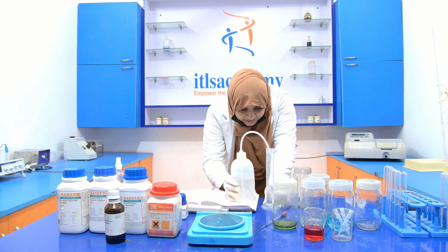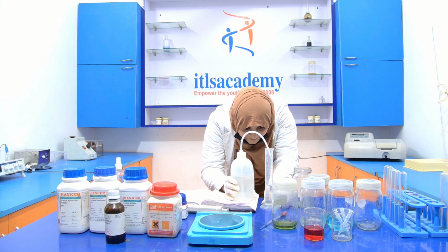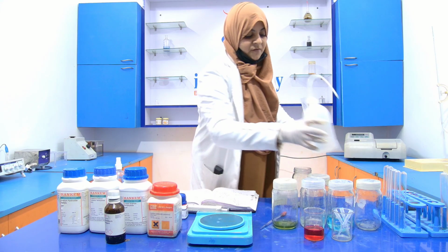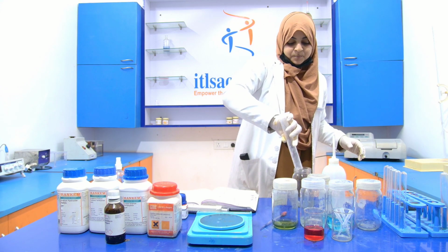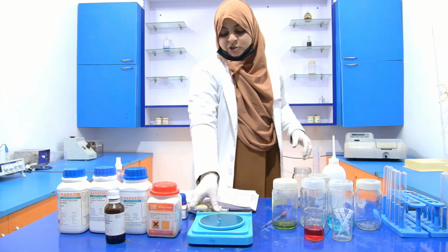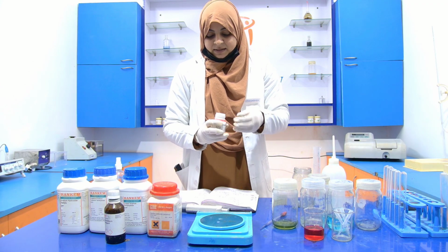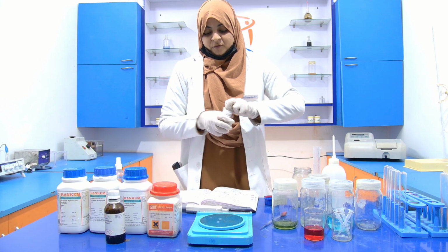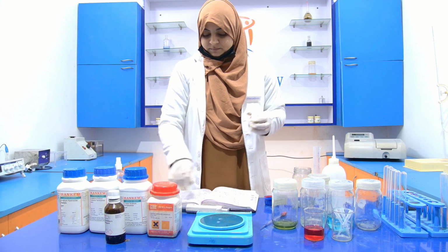With the help of this measuring cylinder, I am measuring 25 ml of distilled water and transferring it into the reagent bottle. Now switch on the weighing balance and take 50 milligram of the BSA.